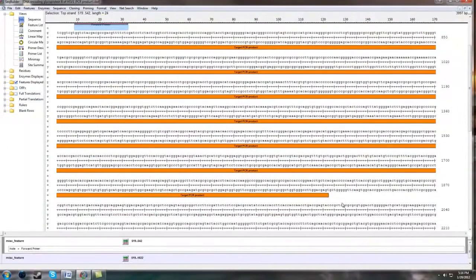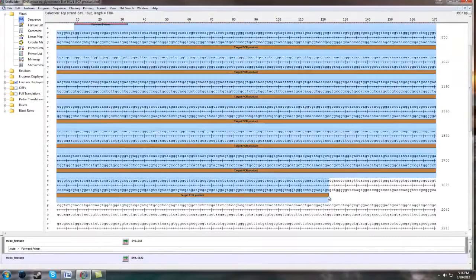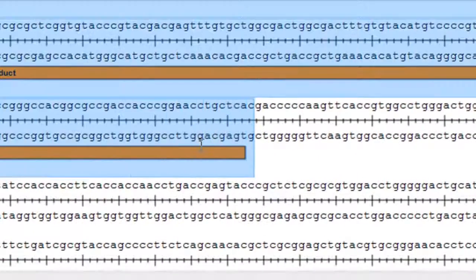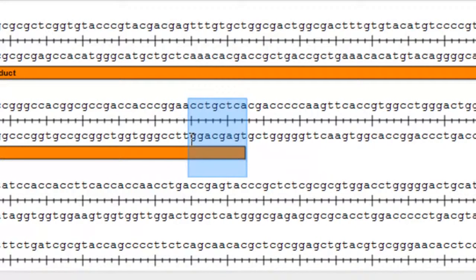The reverse primer, as it sounds, is exactly the opposite. It's the bottom strand, which will be complement to the top strand. In that case, we can amplify this piece of orange sequence that we're interested in.